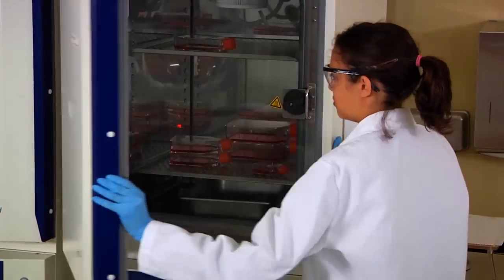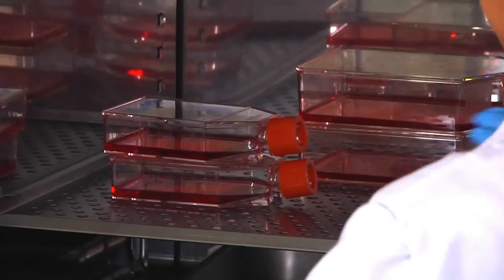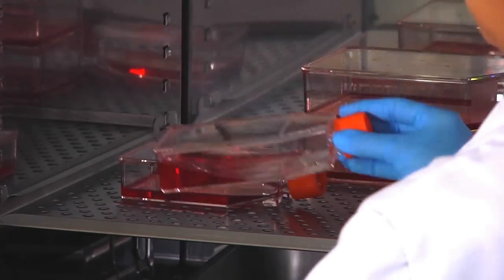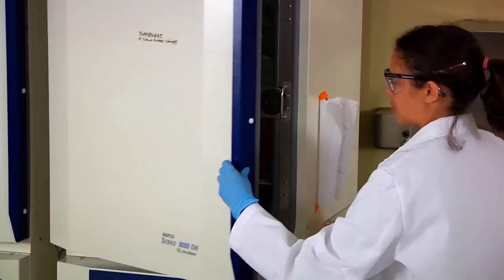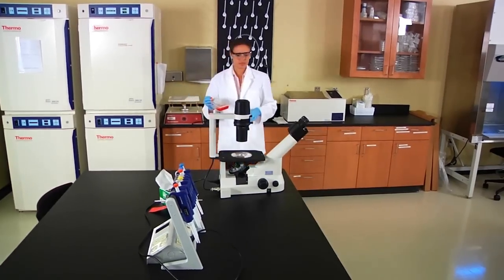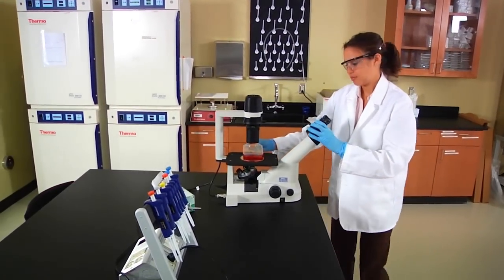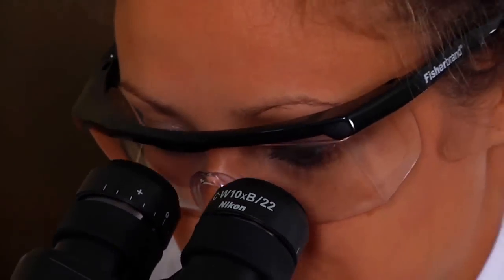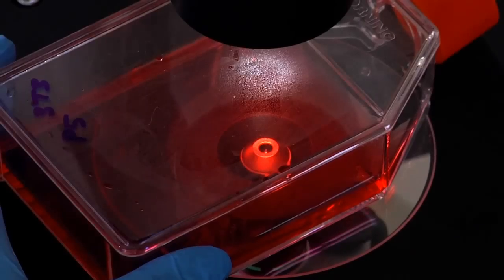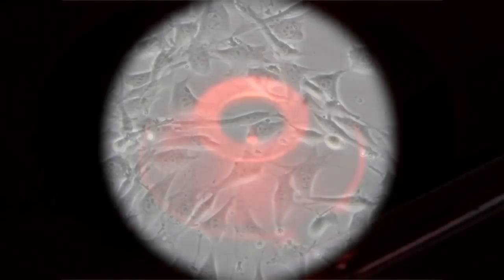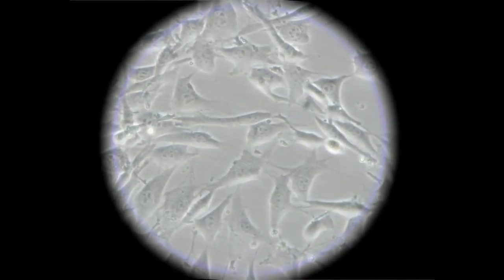To begin, remove the cultured cells from the incubator. Visually inspect the cells to see if there is any change in pH, which can be detected by a discoloration of the indicator phenyl red. Examine the cell culture under an inverted microscope. Look for any signs of contamination or unhealthy cells. These cells look healthy.